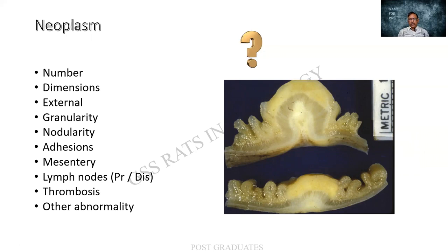Secondly, pseudopolyps can occur. It is a polyp as such, but not a mucosal polyp. It can be because of a lymphoma. It can be because of a leiomyoma arising from the smooth muscle. All these should be borne in mind. And in some areas of the GIT, we can get a gastrointestinal stromal tumor also. These differentials, please be fluent with.